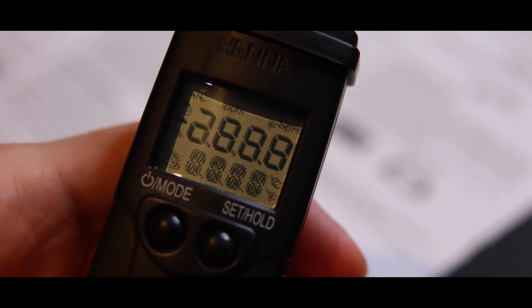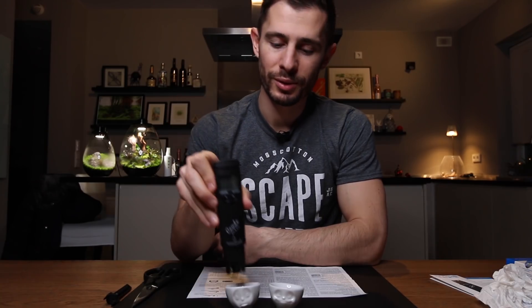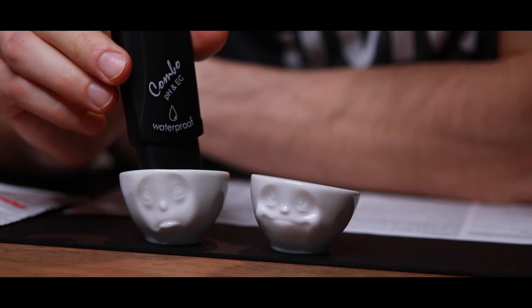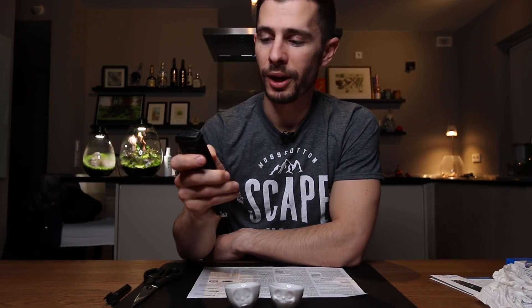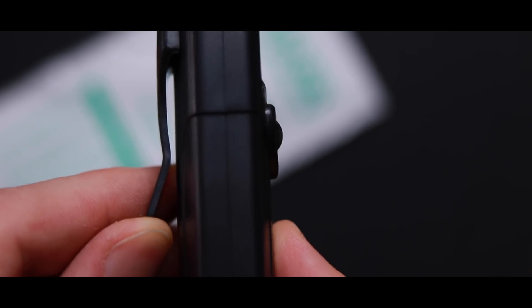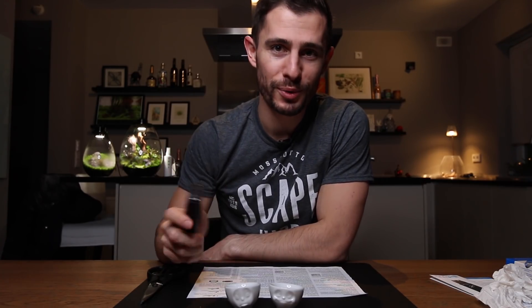That's a lot — you just turn it on, it shows you the battery at 100%. You dip it into the water, let's put it in here — okay it shows us something, whatever it is. I turn it off — that was like 10 seconds of use, so it's gonna last years. And it has a tiny little clip here so if you're using it in the field it's handy. It has all the features right here. So that's it about the Hanna combi tester that measures all those parameters.